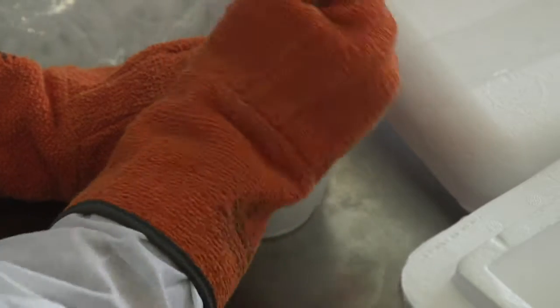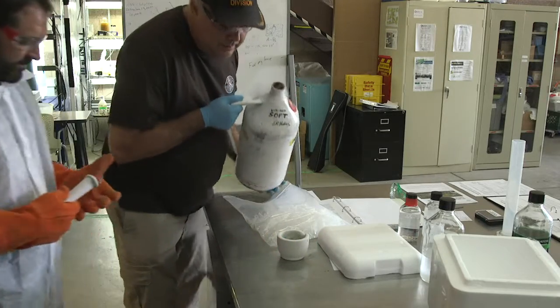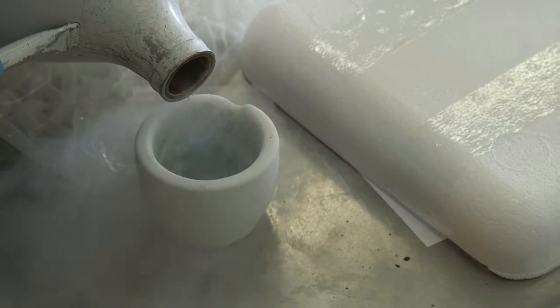Let's see how it's going. Oh, it's getting to a powder — good. A little more.